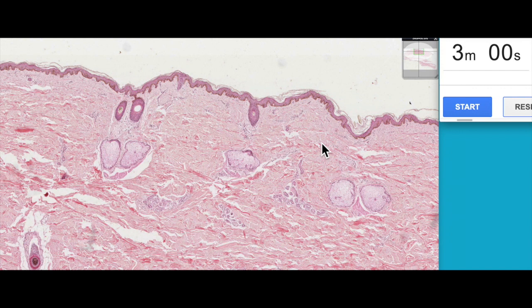This is thin skin. Previously we were looking at thick skin with the resin section, so this is thin skin and I thought it would be a nice difference to have a look at that. Let's start our three minutes.